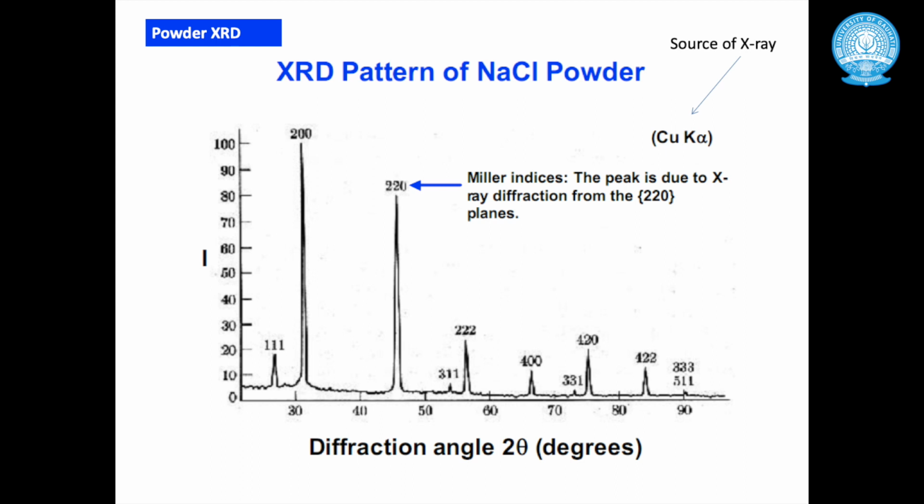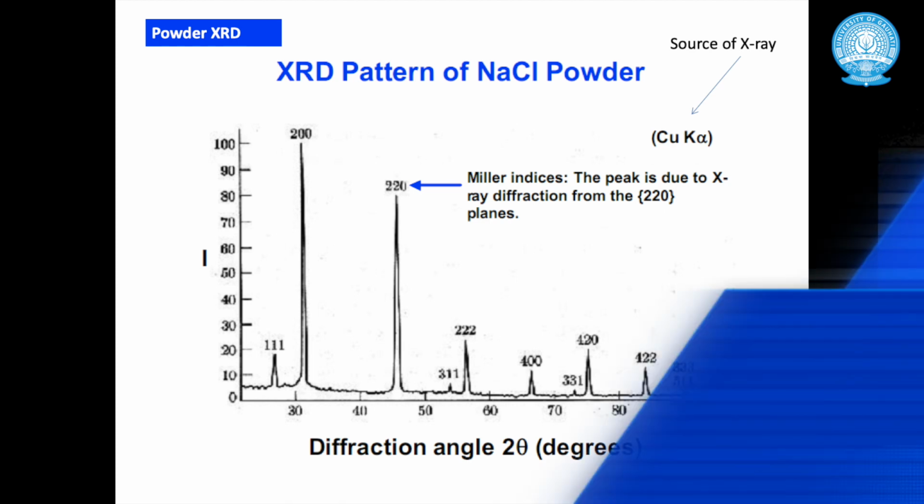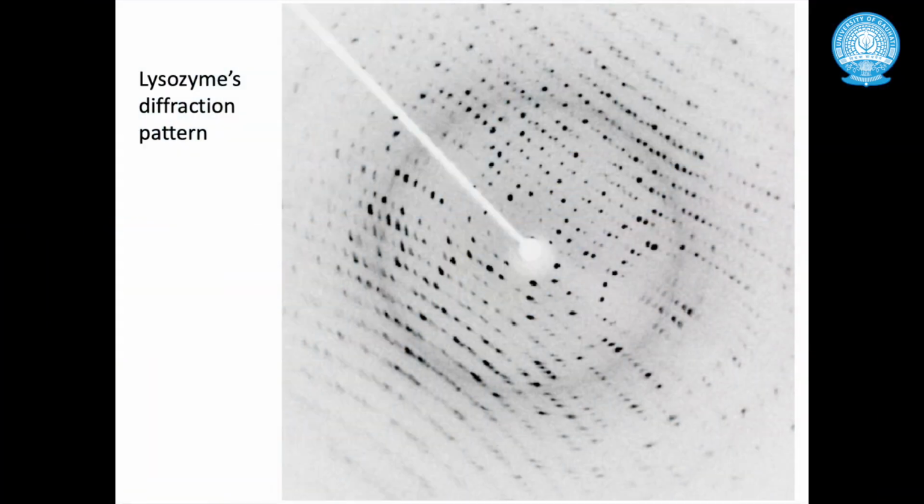For other compounds like crystals, when we have crystals, then we will have this kind of lysozyme diffraction pattern. Here we get to see only dots.